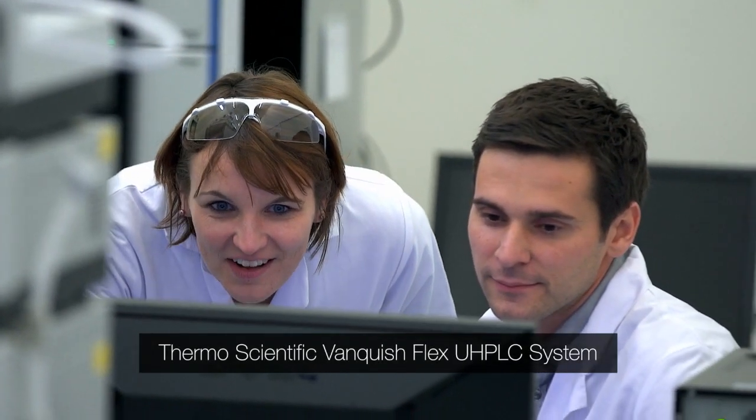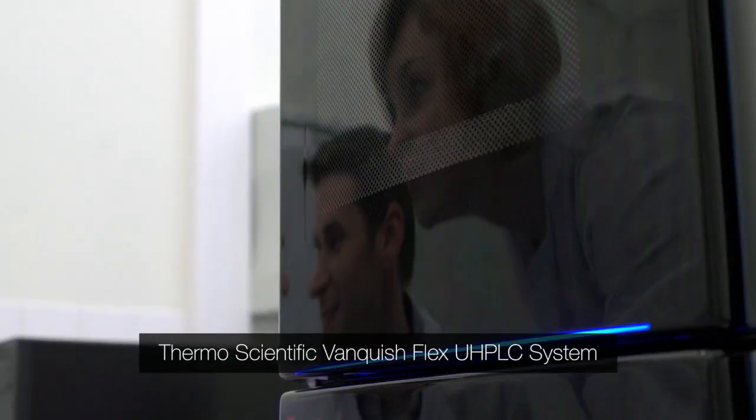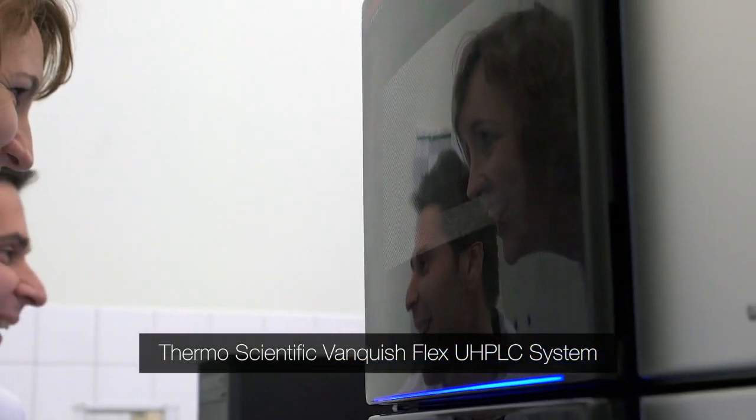So usually when you think of a UHPLC system, you have a pump, an auto sampler, a column compartment, and a detector. With the Vanquish Flex, we have the same, but it doesn't look anymore like we have modules. It's one big thing.